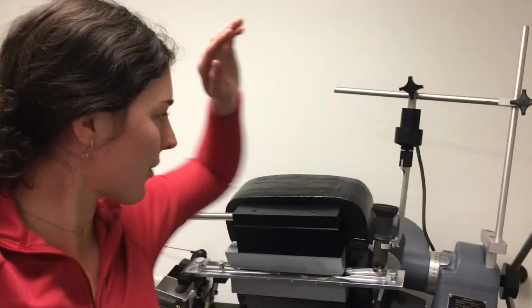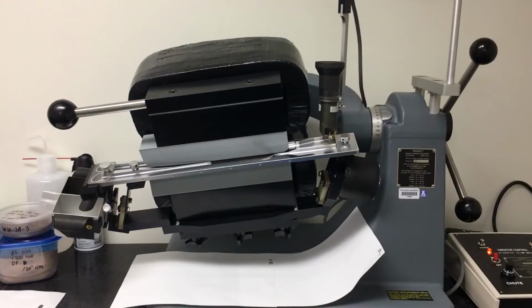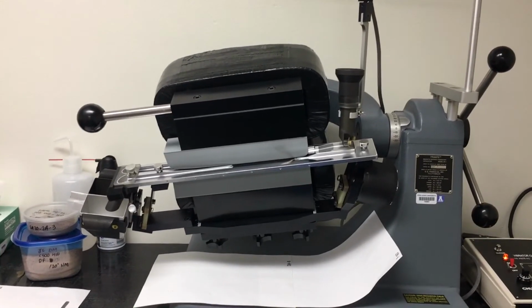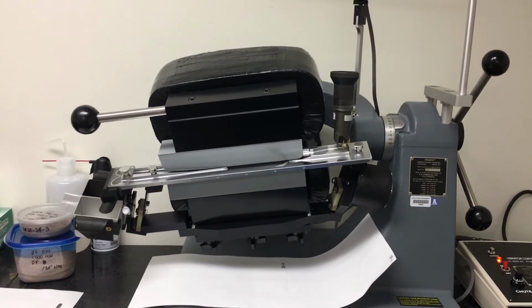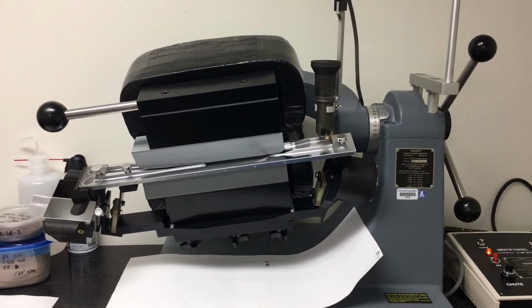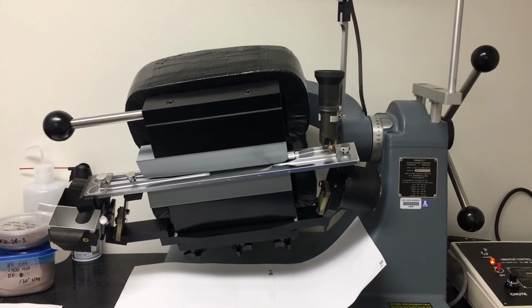After I have hand washed the sample to remove particulates and defiled, meaning using a magnet to remove little pieces of metal and the extremely magnetic material, we move on to the Frantz. The Frantz is a magnetic separator. We do not want magnetic materials for our final analysis, so we remove the magnetic materials so that our grains are easier to identify.